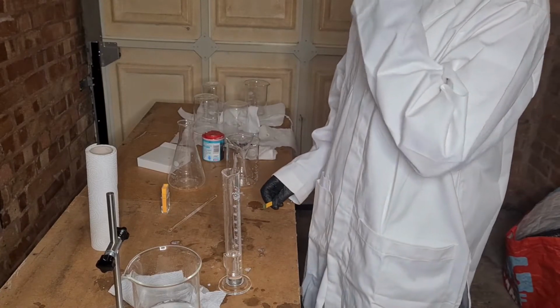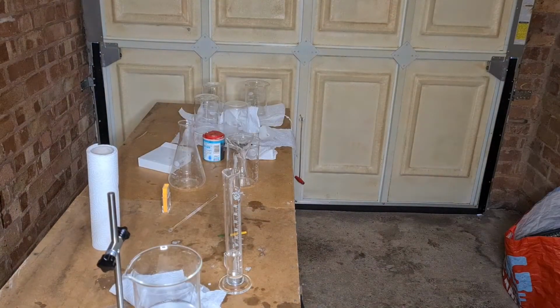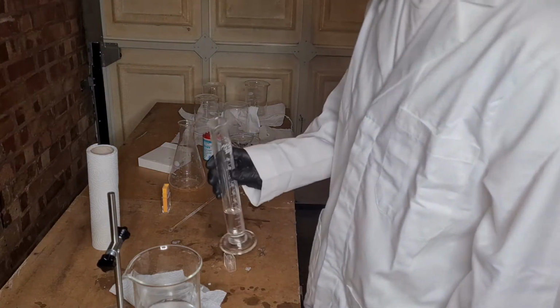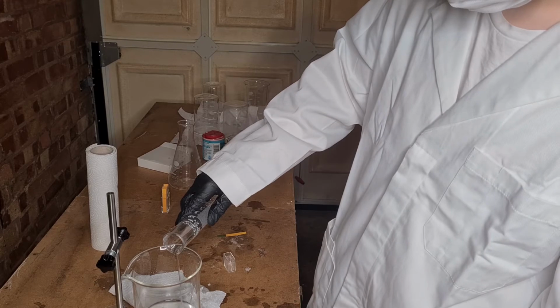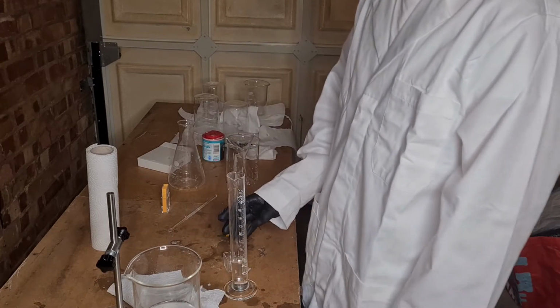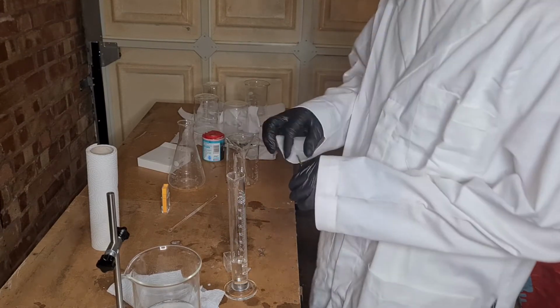And once again, this mask is steaming up. I will go clean this off again so I can see. Seeing is important in chemistry. Vision is very important, hence why you wear these goggles. Anyways, we'll add a little bit more. I believe this reaction is exothermic, I'm not entirely sure.